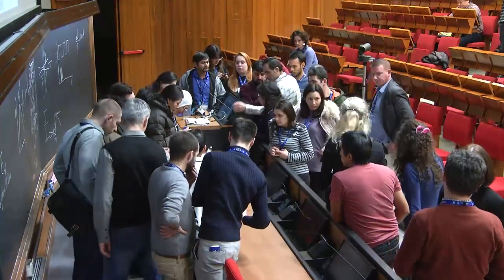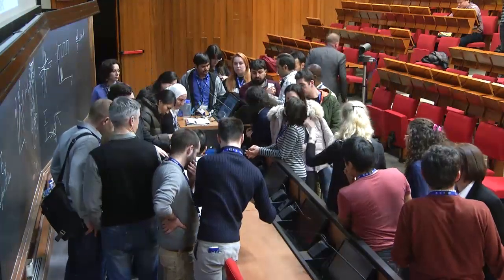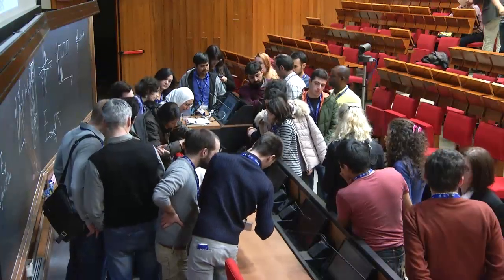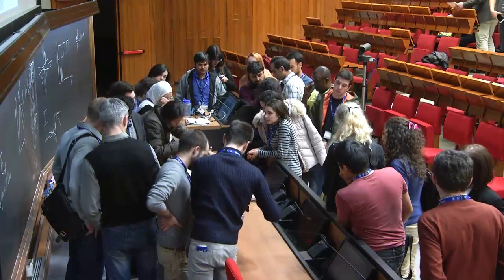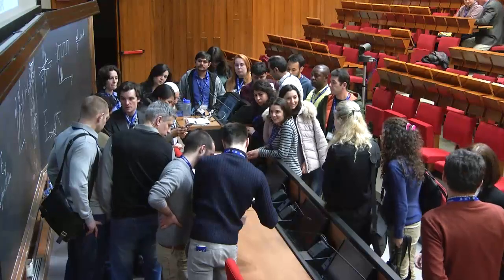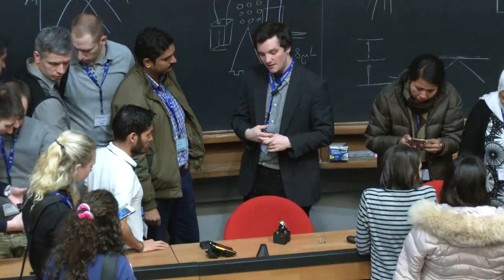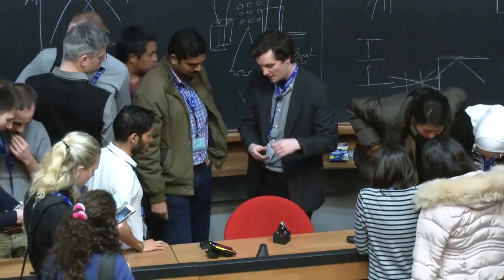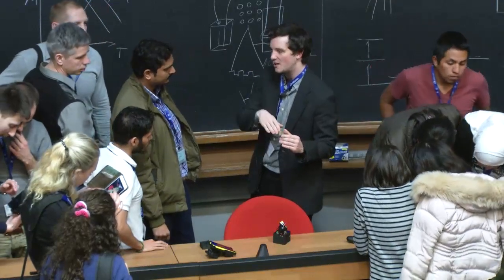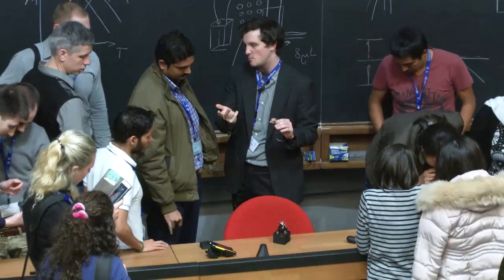But the paper that I wrote recently, it's not necessarily on this device. It's on the framework that calibrates it, that creates a universal calibration. The ACS Nano paper, yeah. So I've created a universal calibration for 500 nanometer hexagonal and square gratings. You can do that using machine learning, such that I can give anybody one of these fabricated through soft lithography, and they can just use it. There's no need for them to calibrate an individual sensor, as long as it's the same structure and it's fabricated in the same manner.